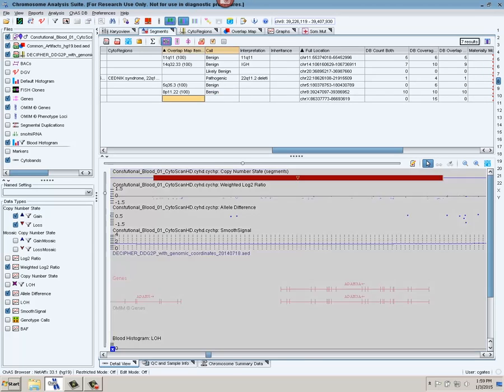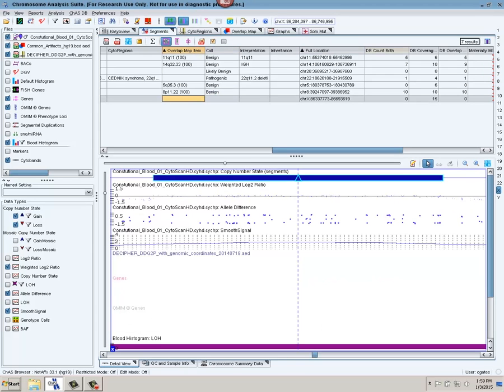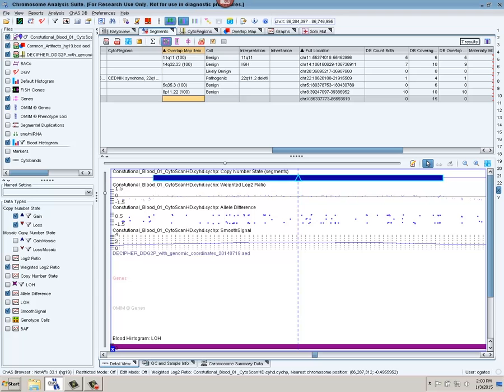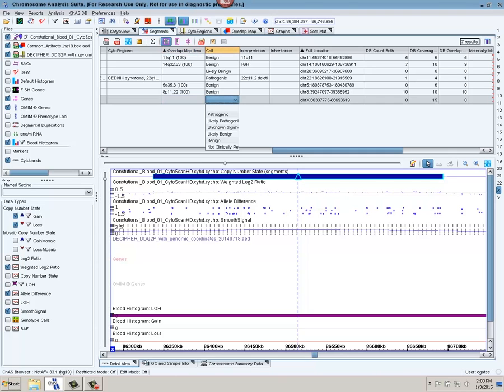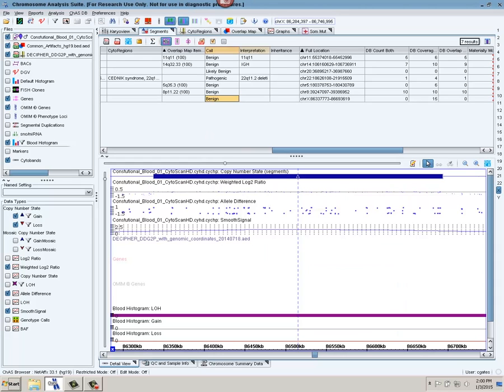Here I am on chromosome X. I haven't seen it in my database before, as I have zero segments. And it does not overlap any of my cytoregions or my overlap map. So again, like we did previously, we can come in here. We do have the genes track turned on, and we can see that there's no genes or no OMIM genes that overlap. So this region is probably not clinically relevant. So I'm going to go ahead and call that benign. And I can put in any sort of interpretation that I want.